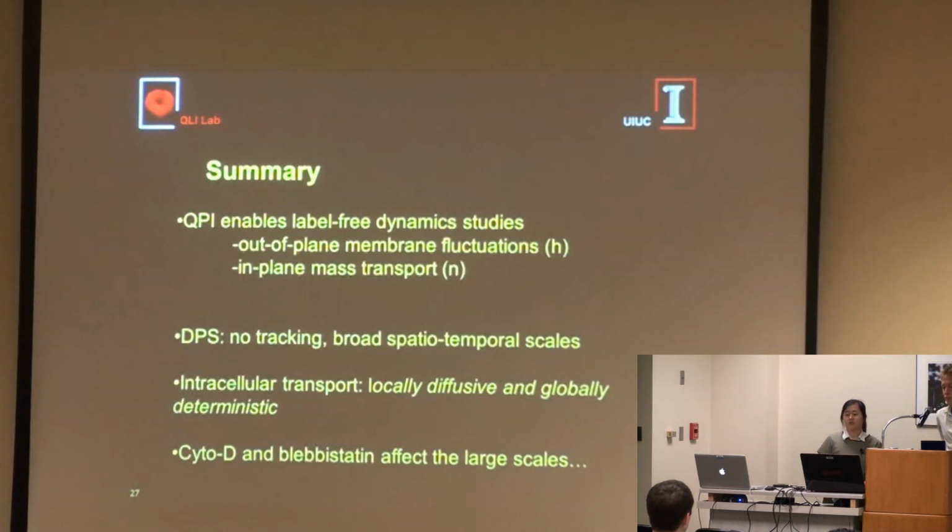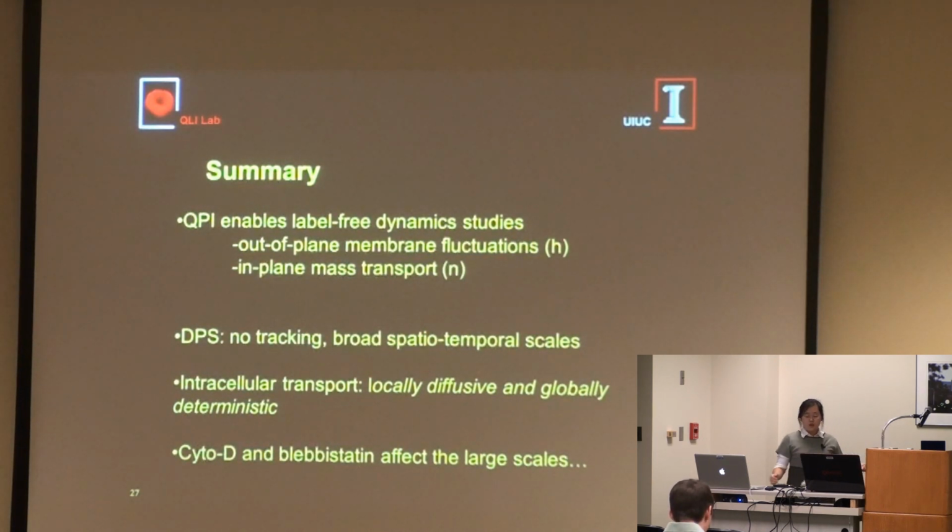Thanks for the presentation. It was really good, really interesting. Do you have a way of detecting which specific particles are moving? Basically that's why we developed DFS, dispersion-relation fluorescence spectroscopy. With the fluorophore attached to the components you are interested in, we are able to.